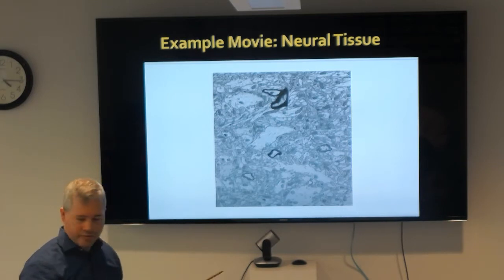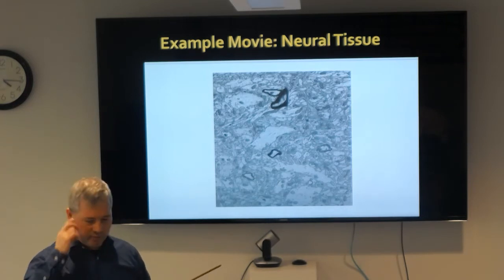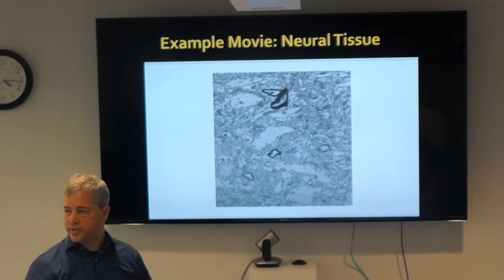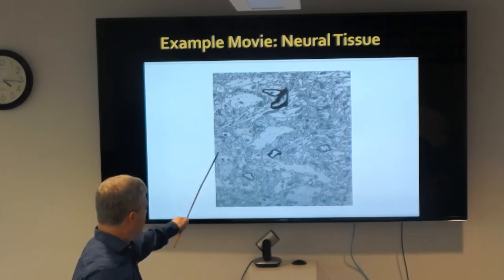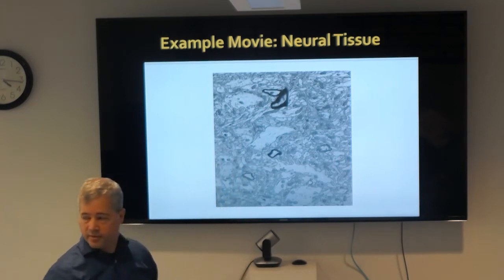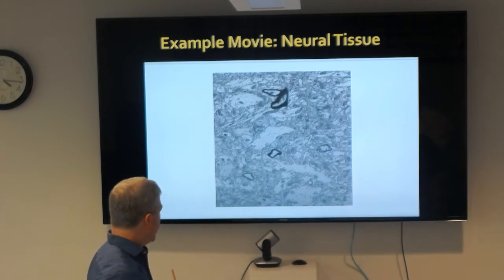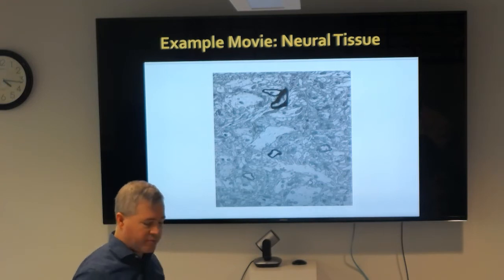Or maybe 15. Our typical field of view is 10 to 20 microns. If you want to view in the highest resolution mode, you can view up to a little less than 40 microns across. But if you're really looking at ultrastructural information of a tissue or a bunch of cells, you can get quite a bit of information from this. You're not getting atomic resolution, but you're getting nanometer or a few nanometer resolution, which, depending on the question you're asking, can often be good enough.